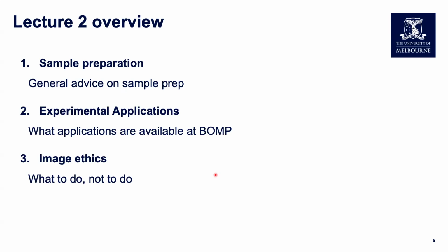And then finally, we'll cover a little bit on image ethics, what you can do and what not to do once you've got your actual data, and that will hopefully segue nicely into Ellie's talk next week on bioimage analysis pipelines.